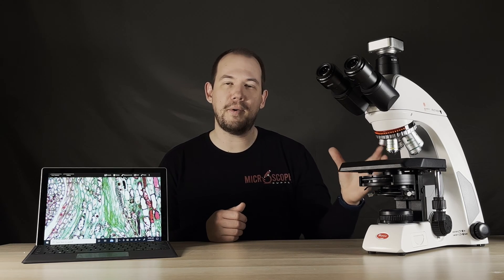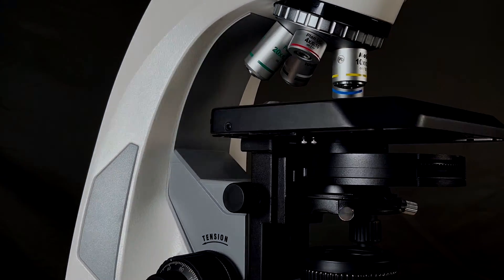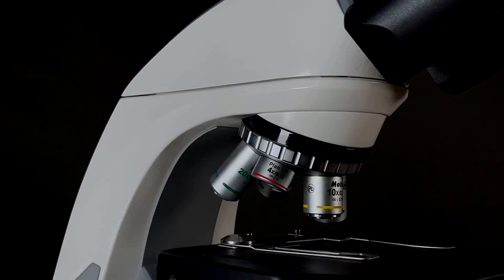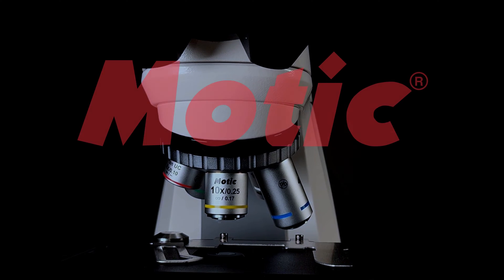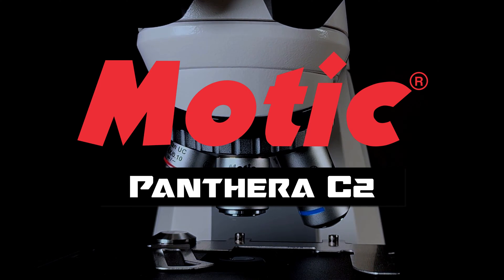Welcome to Microscope Supply. Today we're doing a product spotlight on the Motic Panthera C2. The Panthera C2 is a biological compound upright microscope that has a ton of features to love and some options that make it great for just about any application.